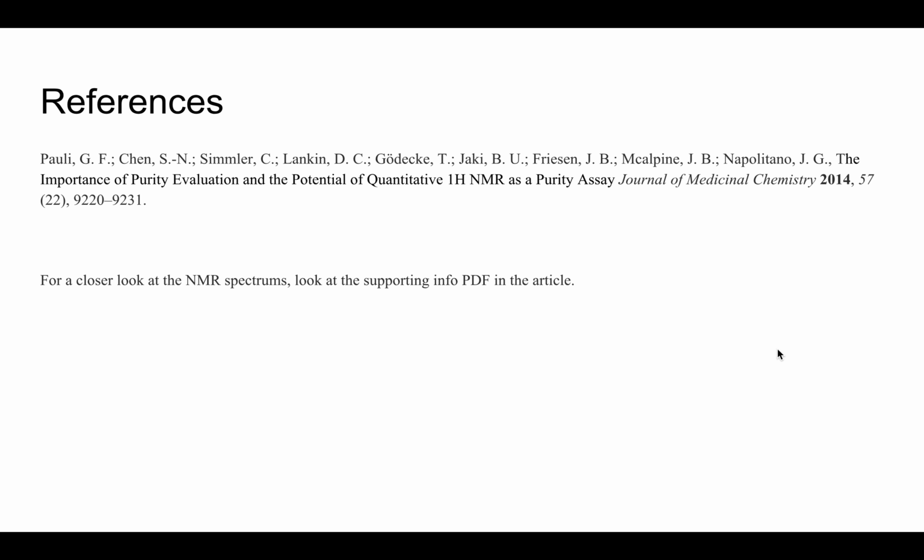Before I begin, I have to give proper credit to the authors of this journal article, where they discuss in detail the process of quantitative proton NMR, as well as give a step-by-step detailed guide to calculating percent purity for each of the four methods. These authors have published the journal article, The Importance of Purity Evaluation and the Potential of Quantitative Proton NMR as a Purity Assay. I simply want to convert the information that was given in text form and turn it into a video format so that the methods are more accessible to a wider audience of individuals.